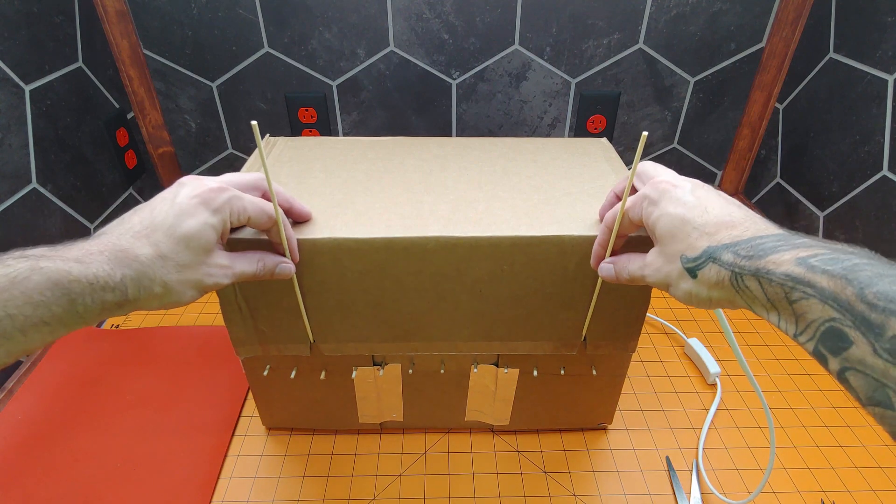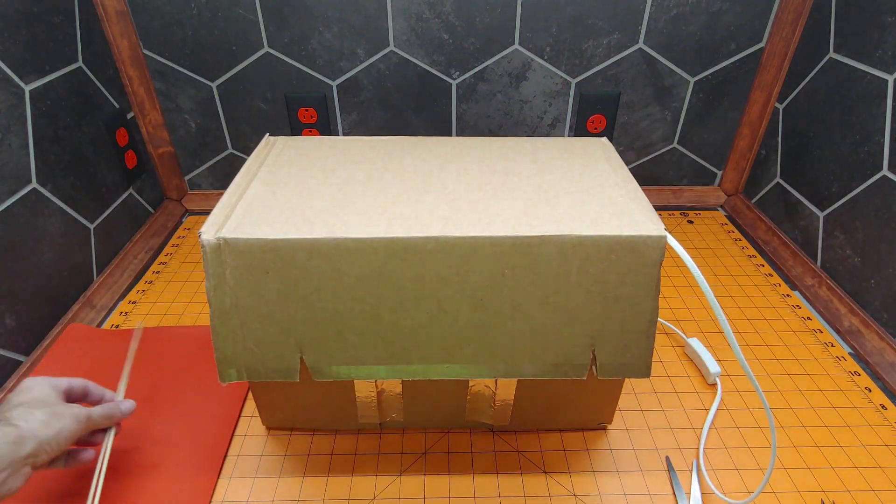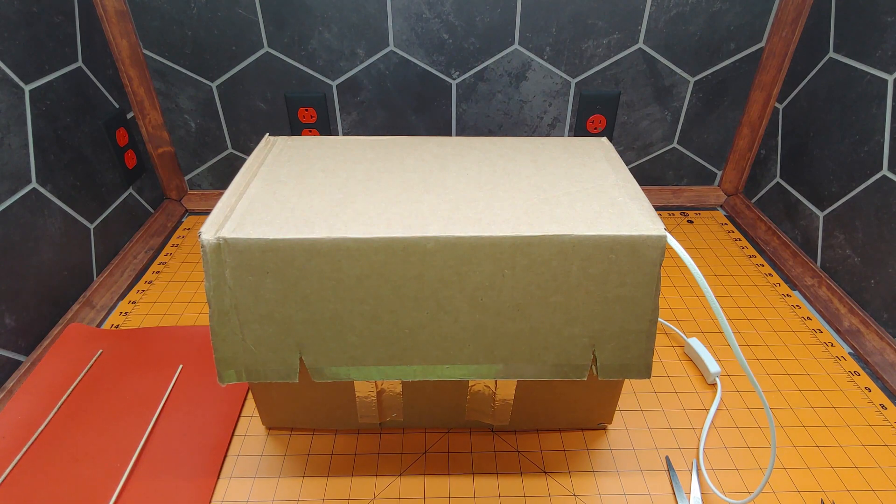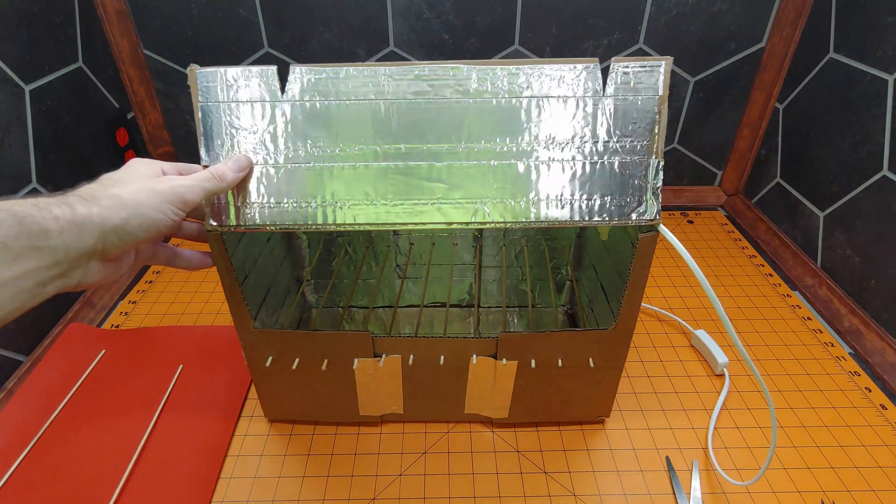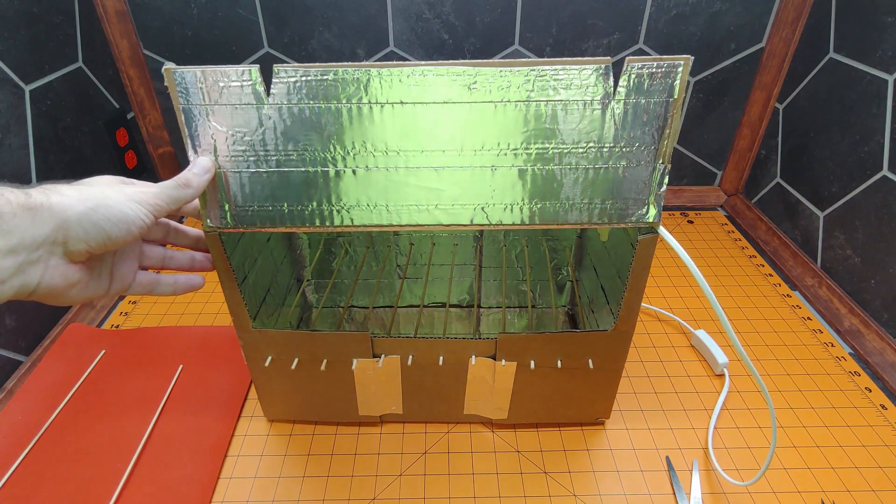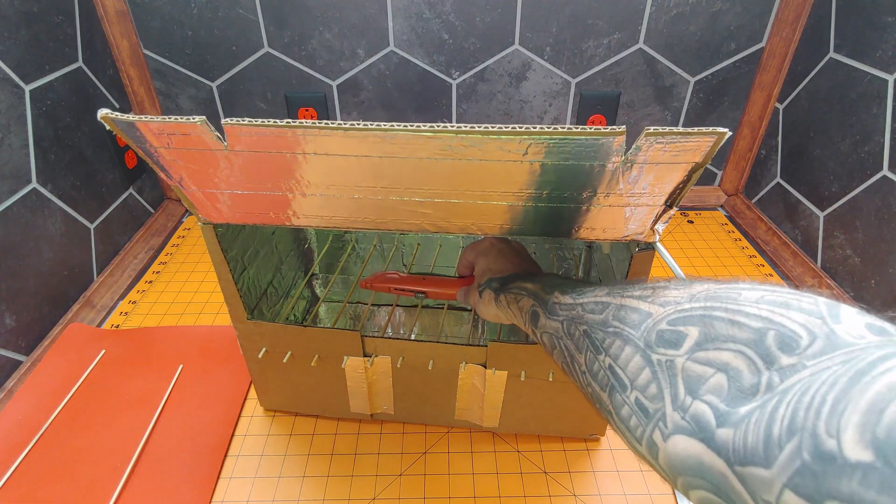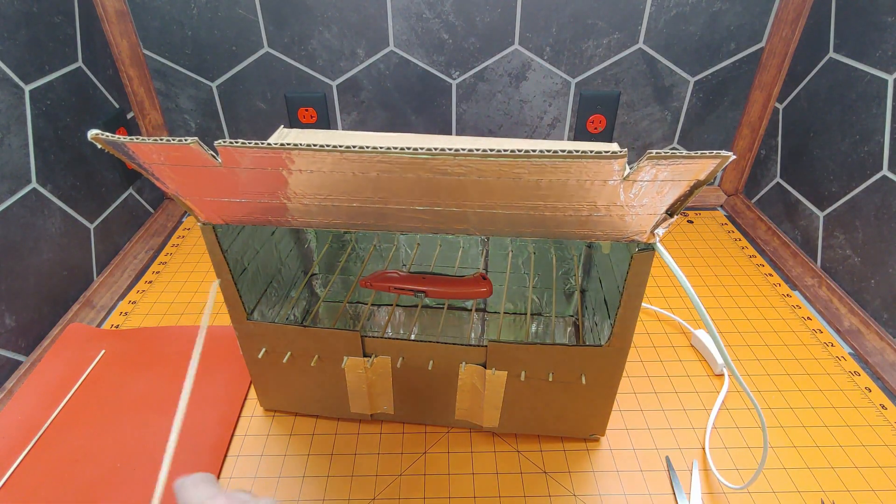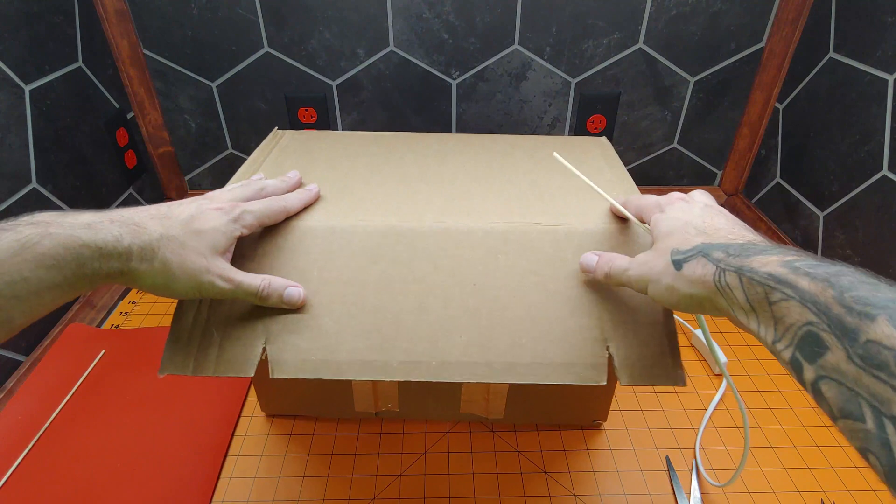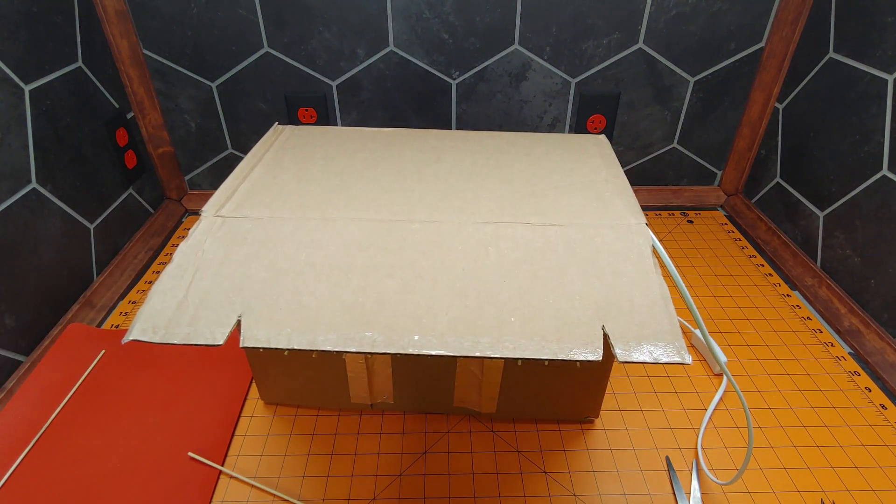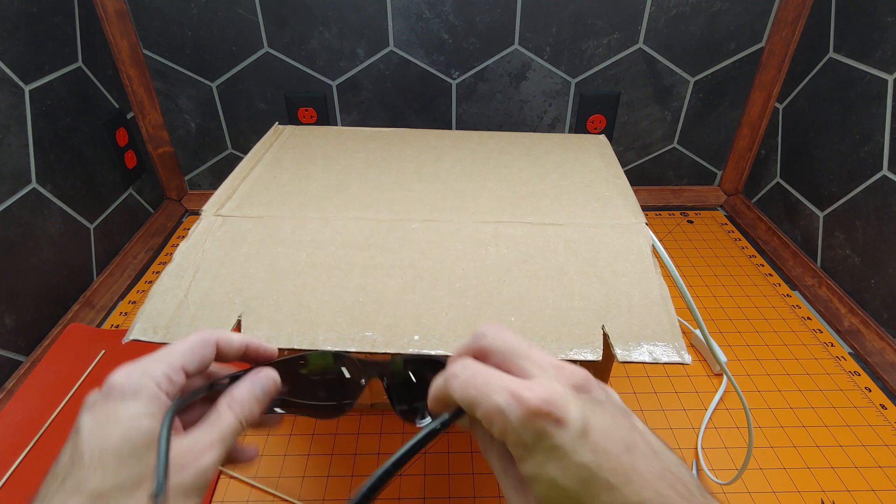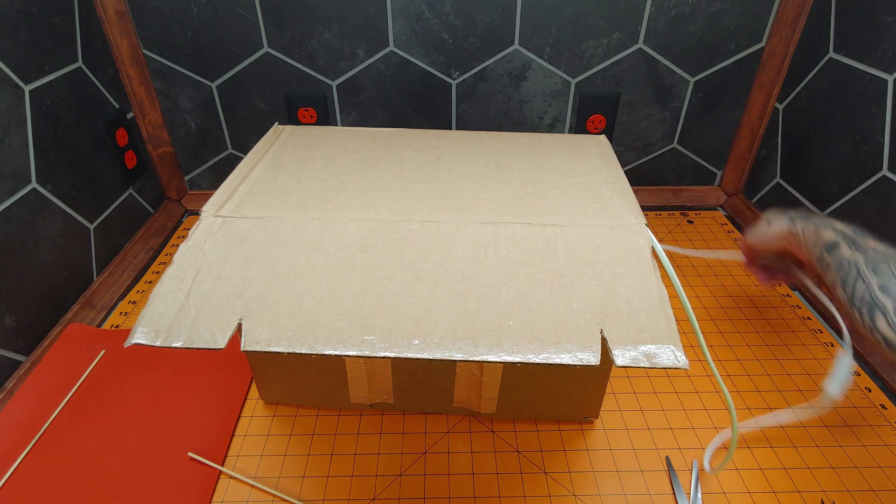So, now we can test this out. What we're going to do is open this up. We'll put something inside. Let's just pretend we need to sanitize this. We will seal our box. Actually, we won't seal it right now, just for the test. We will make sure that we are wearing our eye protection for the test. And we'll plug this in.